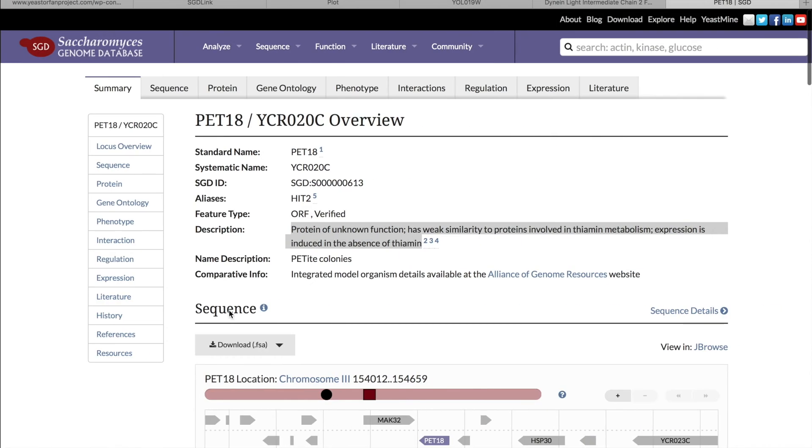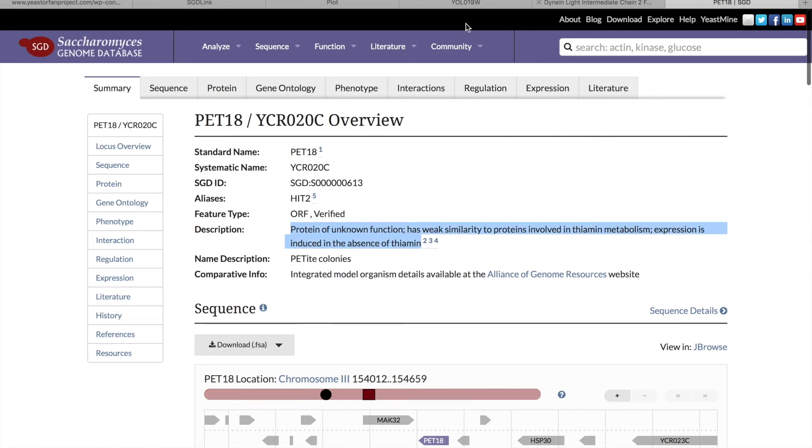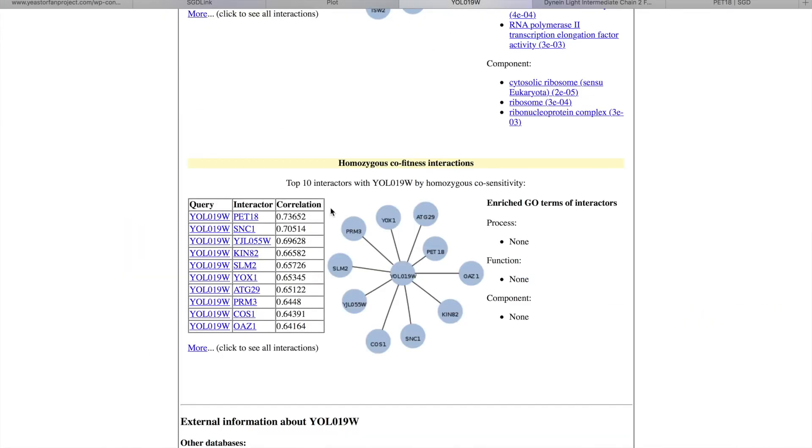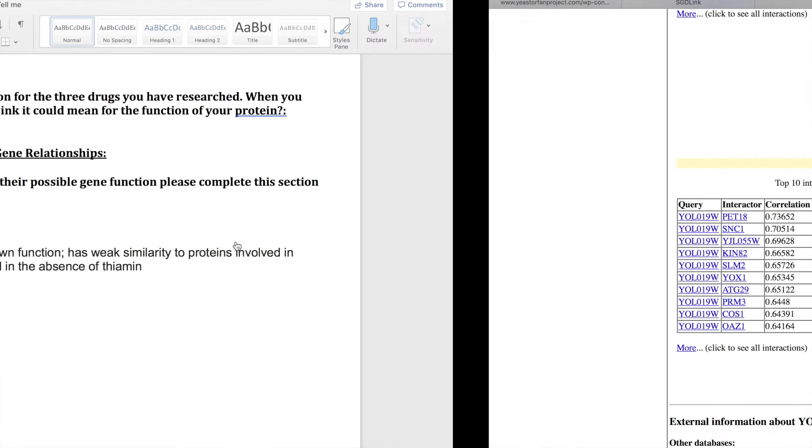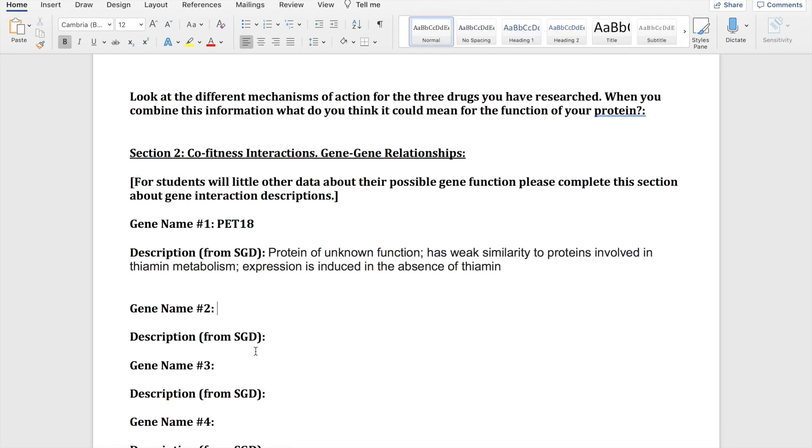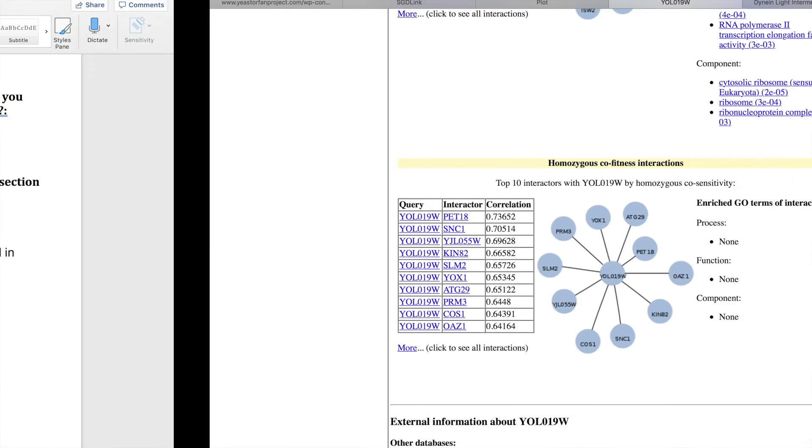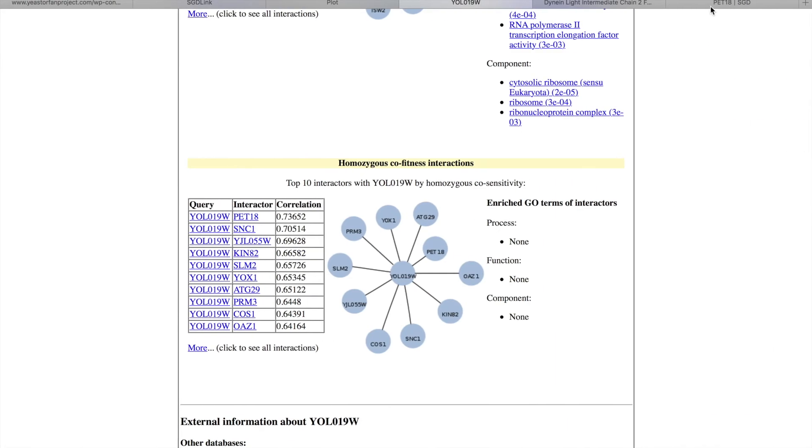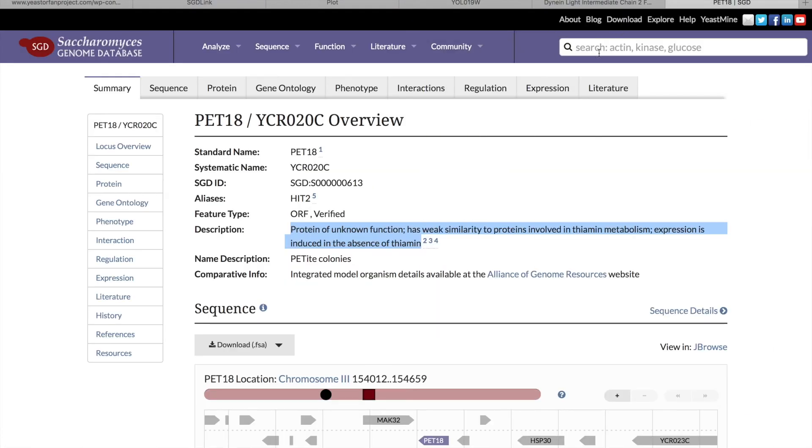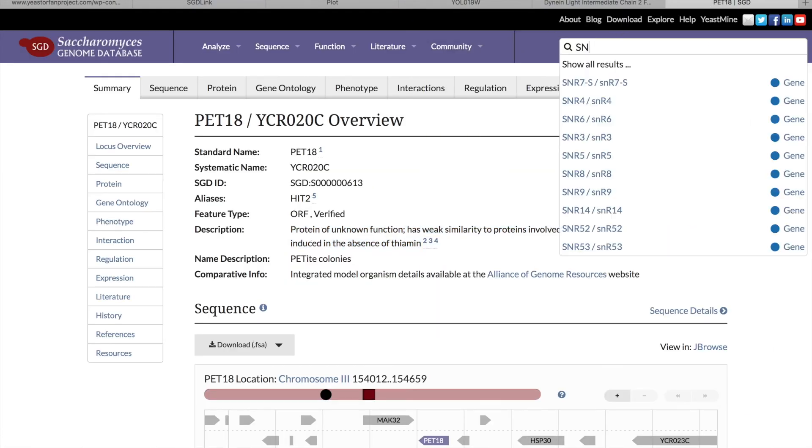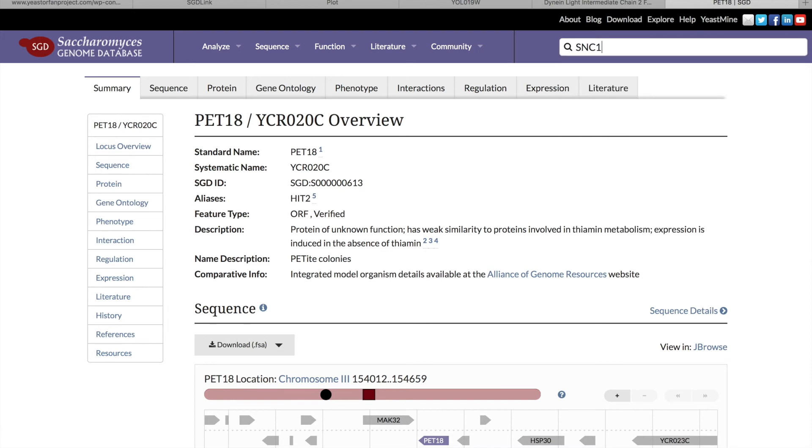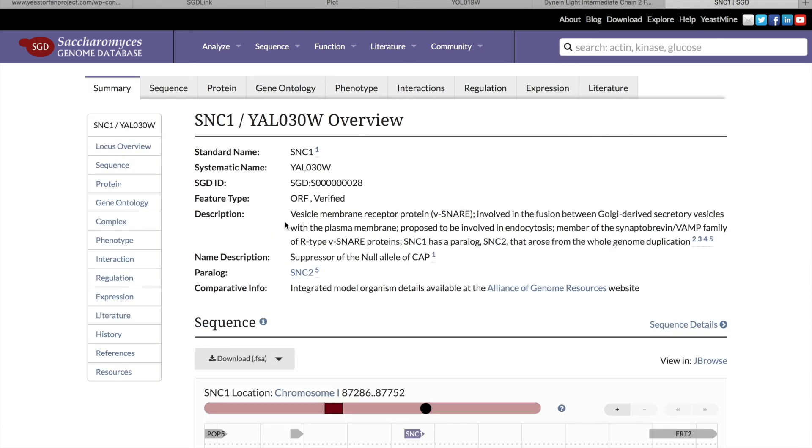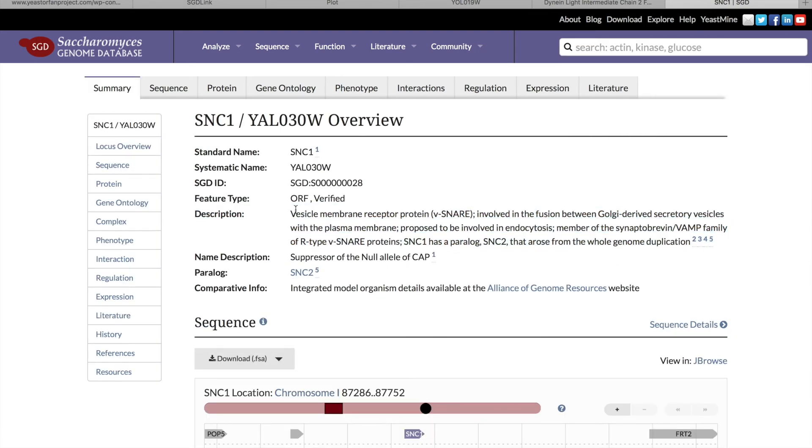And now getting gene name number two, and that is SNC1. Searching that in the SGD again, and copying and pasting the description.